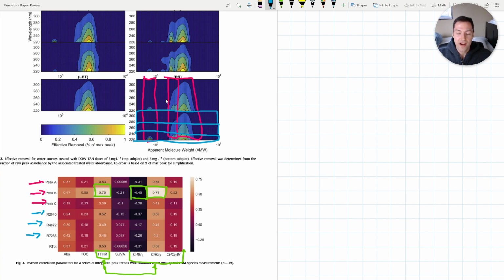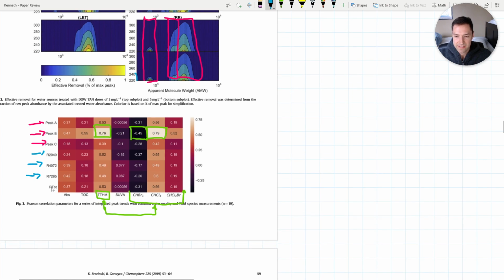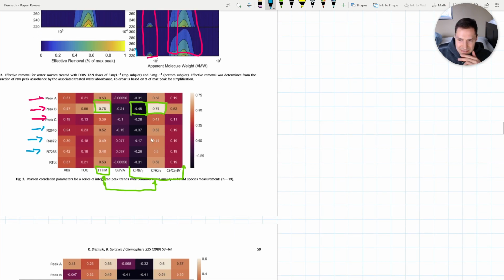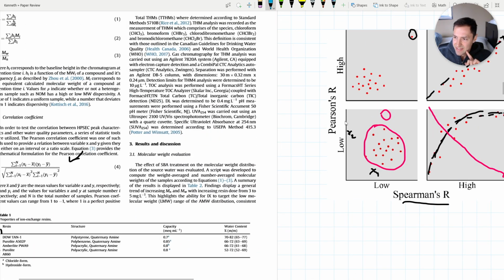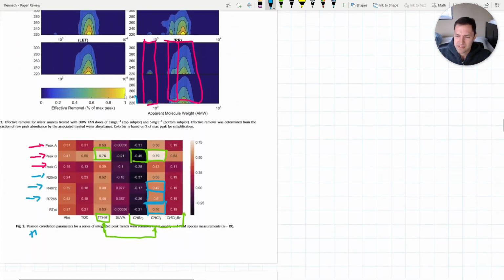So you can see that we're actually even slicing all of the available wavelength ranges as well by capturing this. And what we also find is that, again, those really didn't correspond too much with high values for the Pearson correlation coefficient. Again, we see values of close to 0.6. But again, we sort of have a general idea. This is all for the Pearson. And again, the Pearson is the one that is kind of prone to outliers. So maybe those values aren't as pronounced as we'd like.